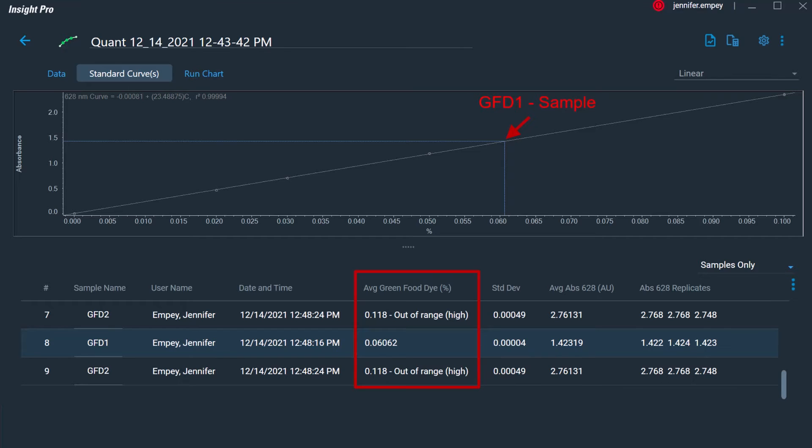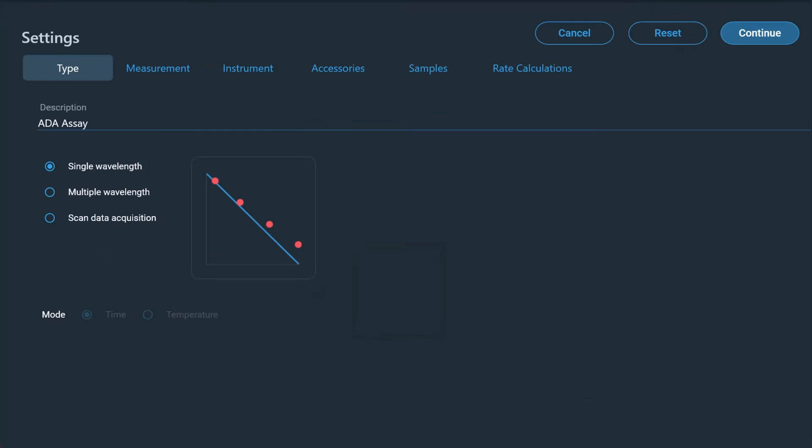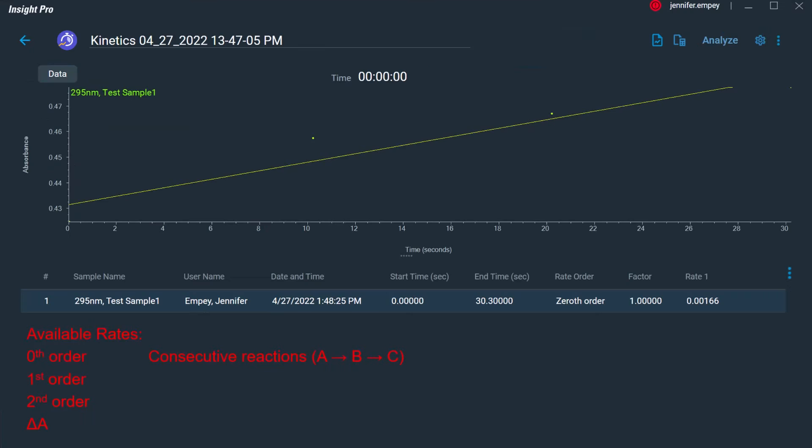The Kinetics application can be used to measure the absorbance of a sample as a function of time or temperature and is commonly used to determine rates of reactions. The sample can be monitored at a single wavelength, at multiple wavelengths, or a spectrum can be collected at each time point. After data collection, the absorbance can be fit to a selection of common rate equations including first order, second order, and consecutive reactions among others. From these fits, the reaction rate and activities can be determined.